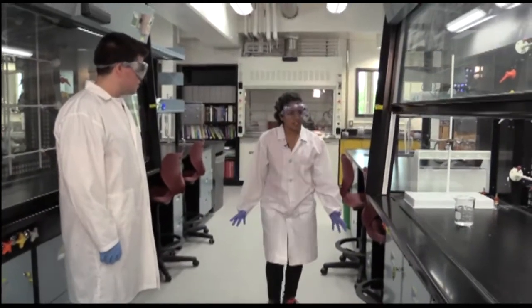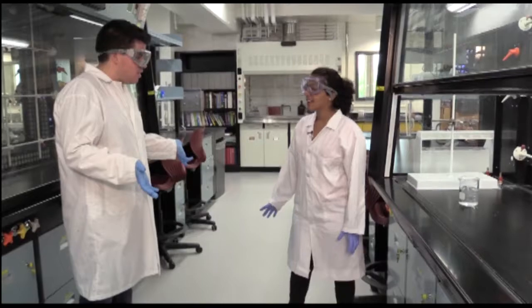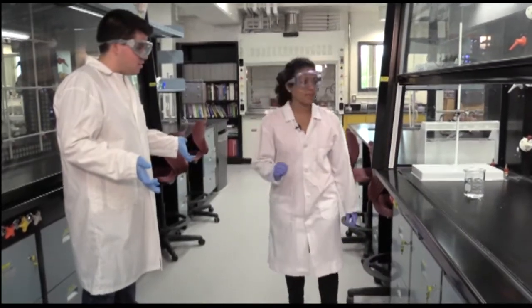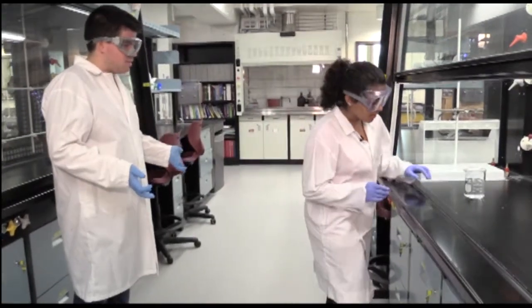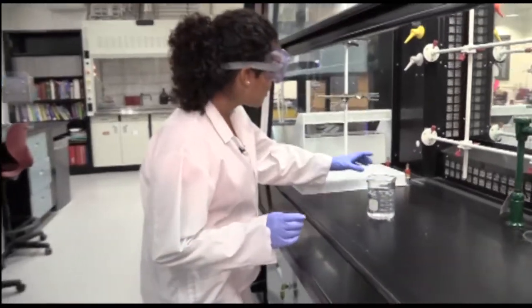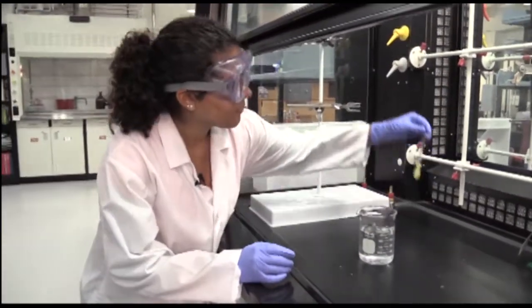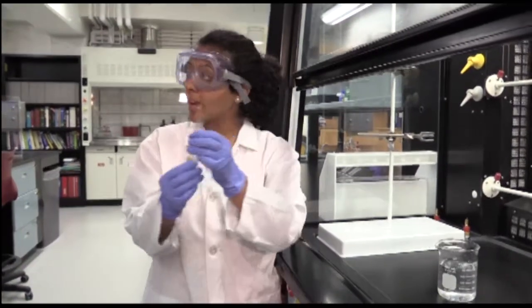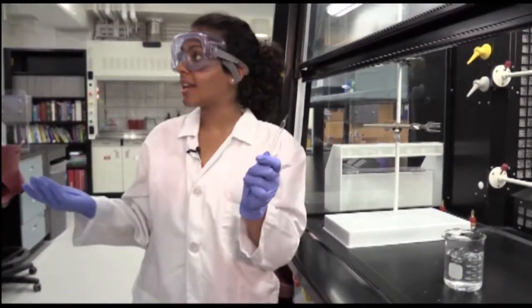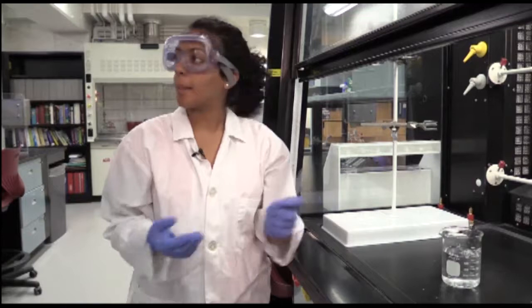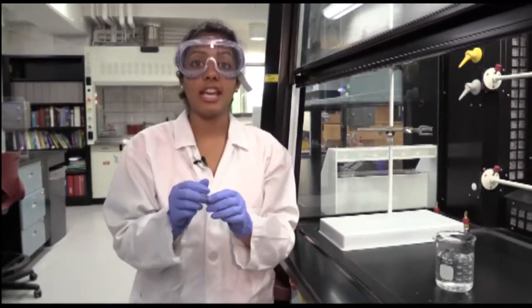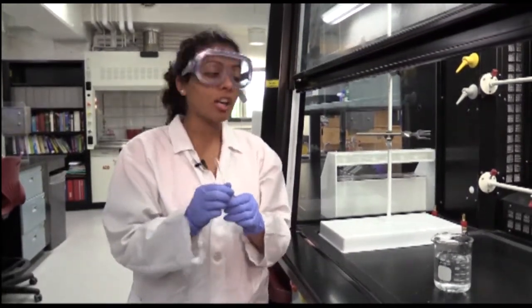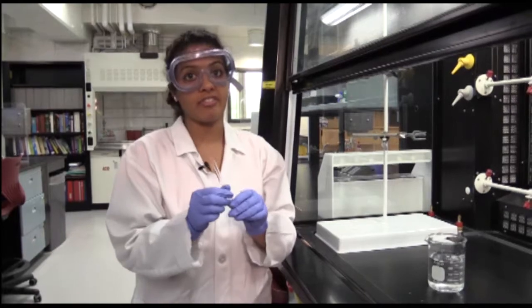Where's the broken glass? You're crazy. There was nothing. No, I know broken glass when I hear broken glass. Oh, found it. Well, that's okay. Things break. Accidents happen in the lab. We just got to clean it up. You shouldn't be afraid to tell your TA if something breaks. We got to clean it up and make sure everyone is safe in the lab.